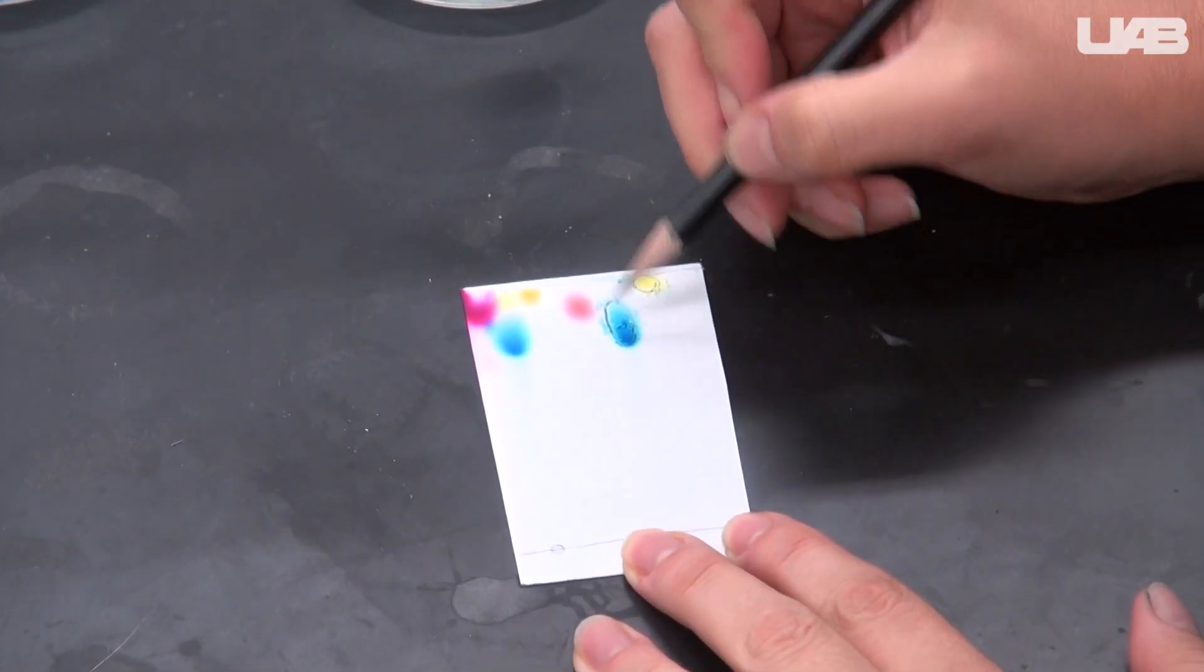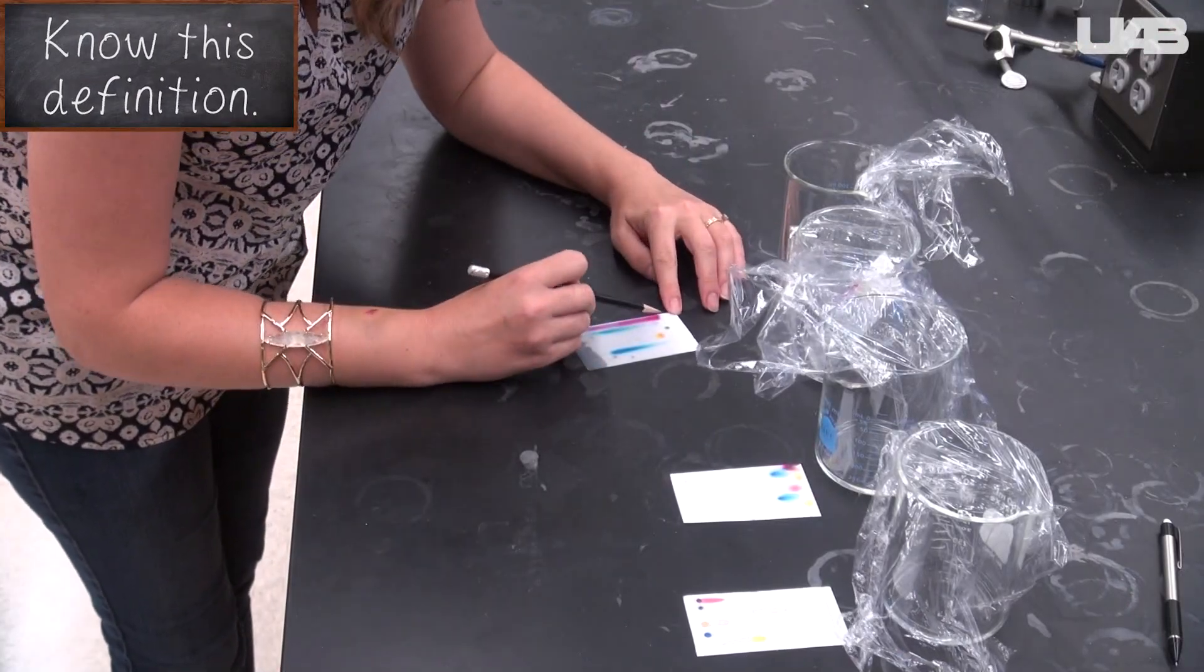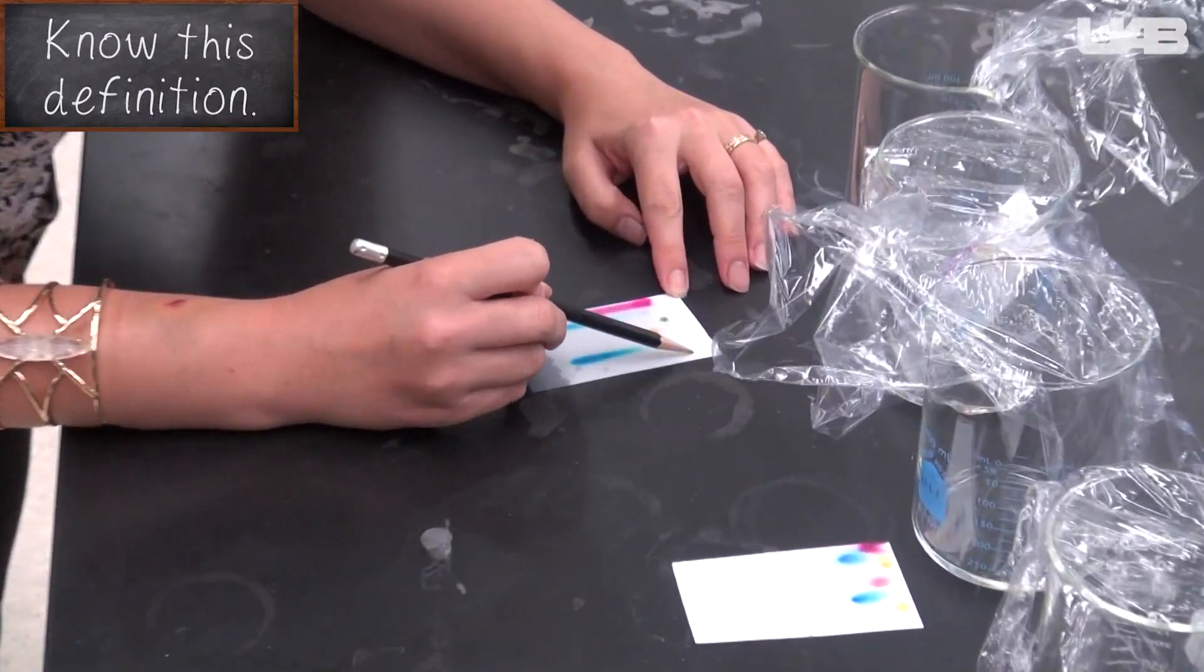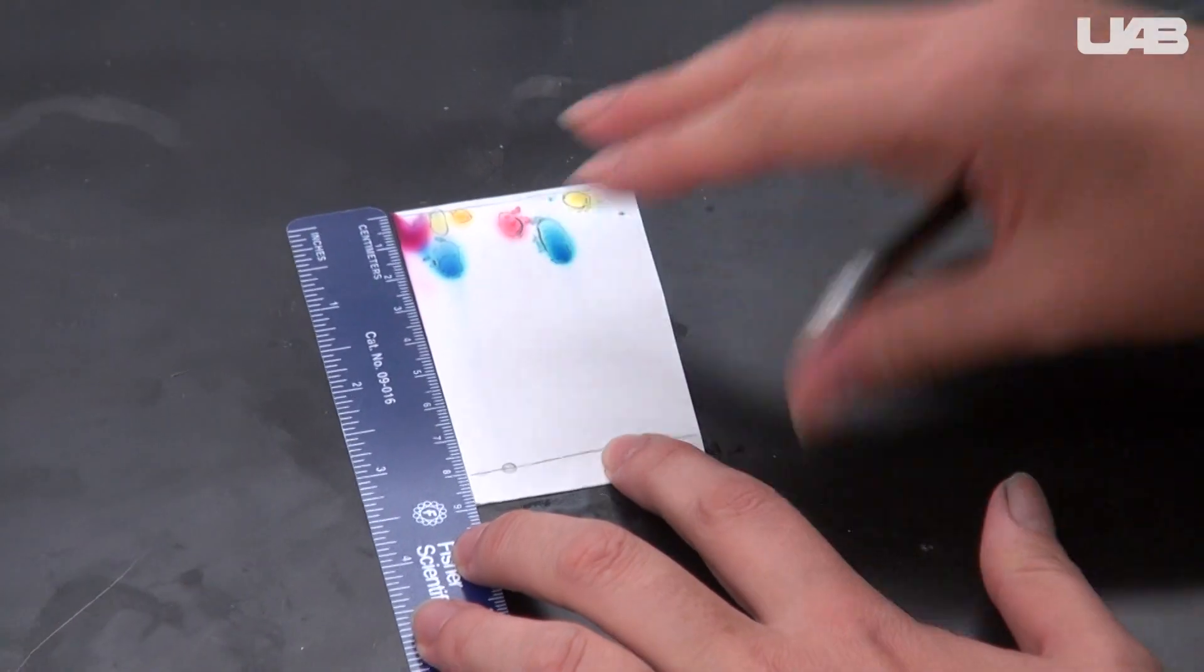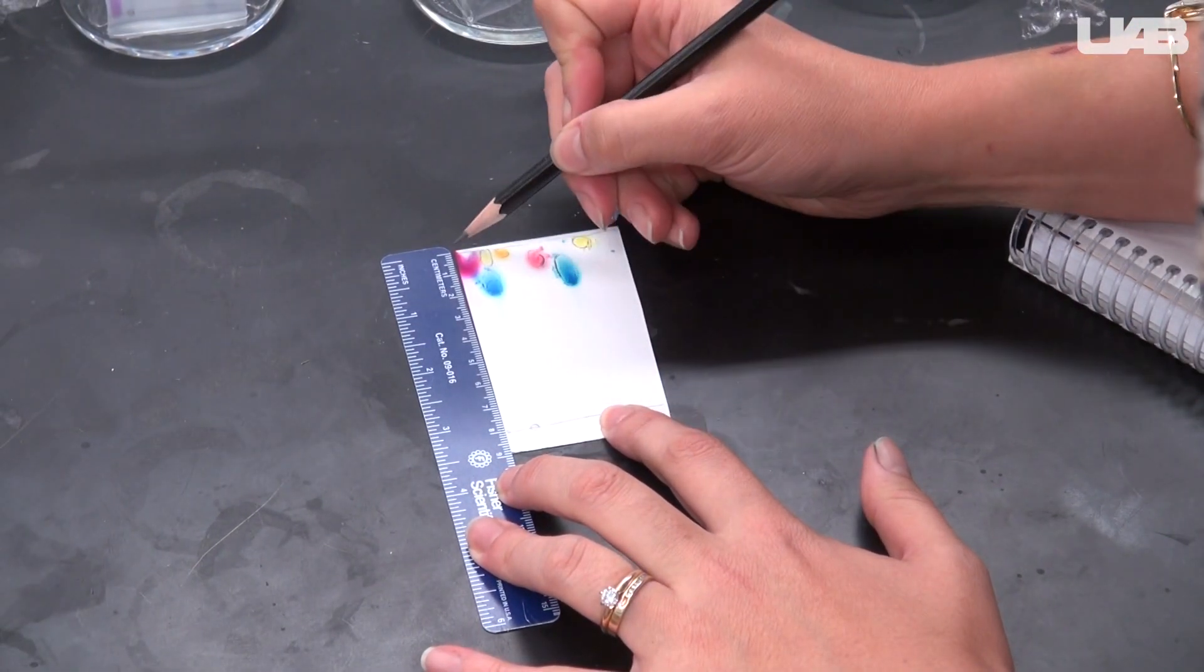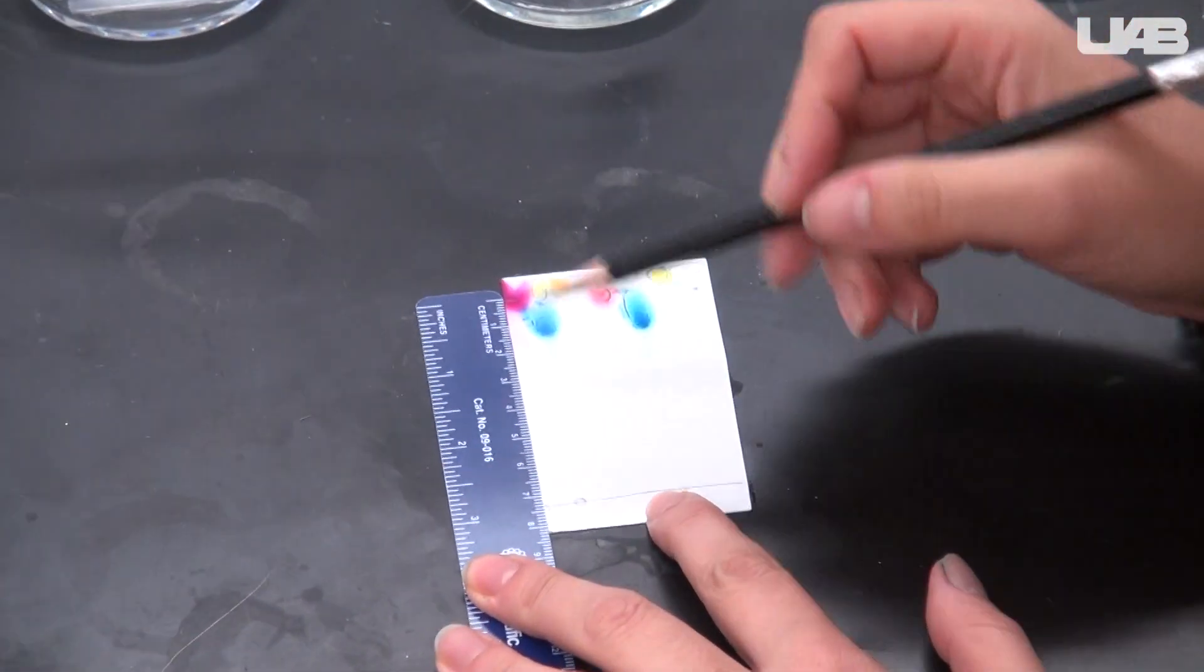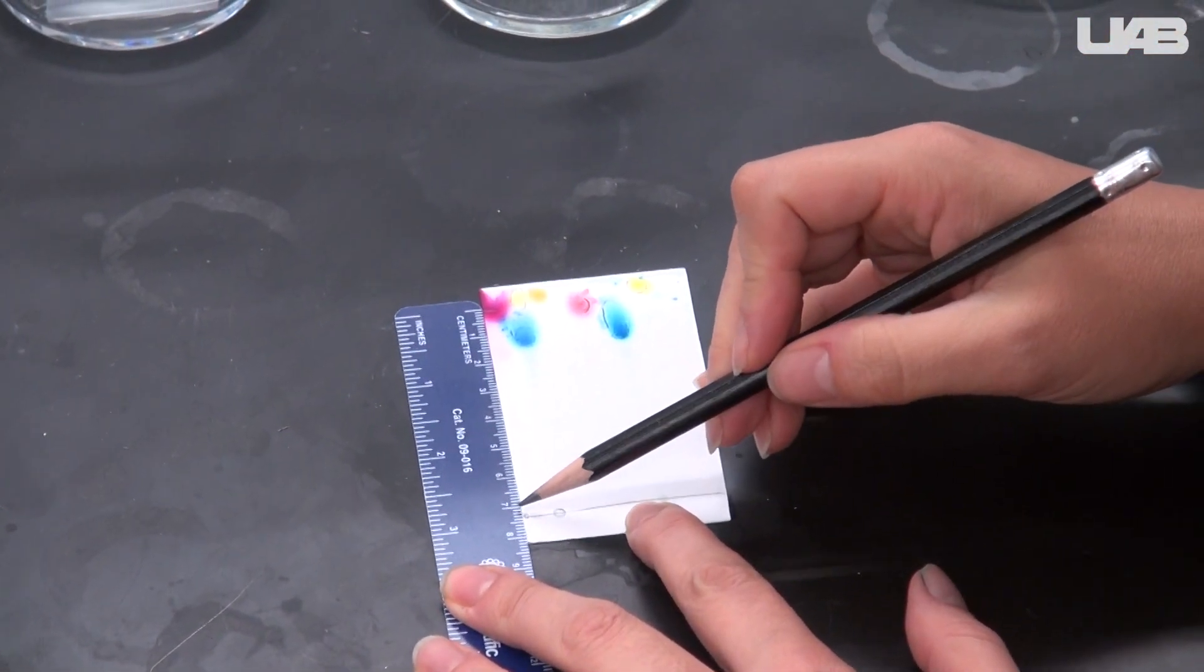Use your pencil to mark any areas of color that are faint or hard to see. Mark the solvent line, the highest level that the solvent reached on the plate. Measure from the line that you made along the bottom in the beginning up to the solvent line and record this value. Then measure between the line you made in the beginning and the darkest part of each spot and record these values.